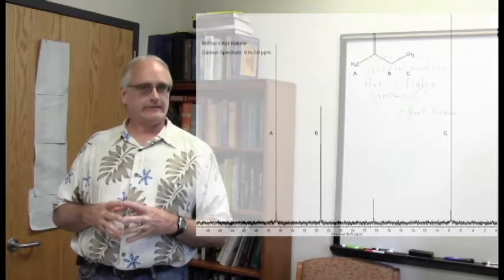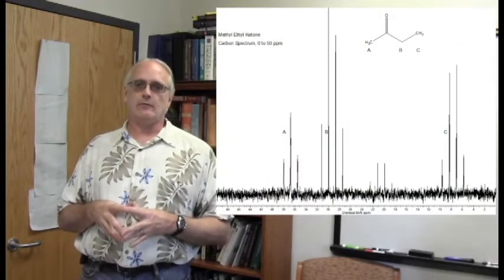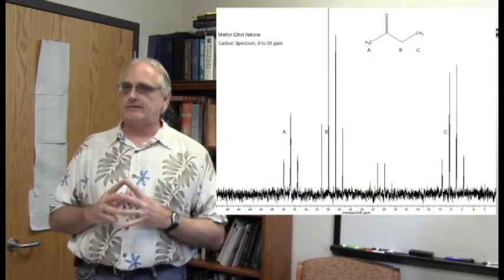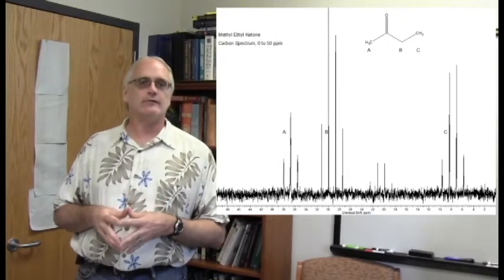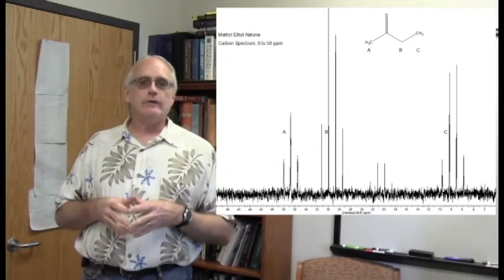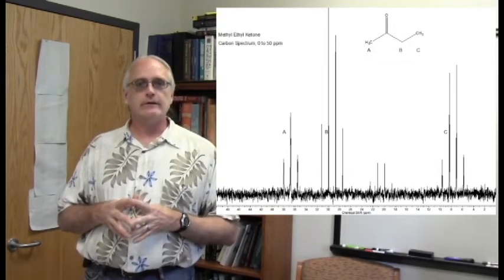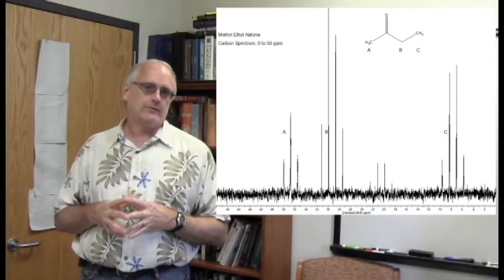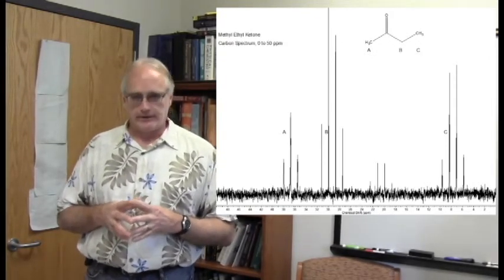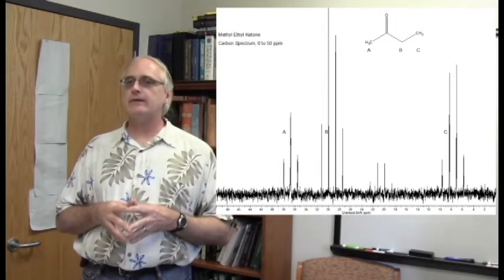Now take a look at this spectrum. I assure you, this is exactly the same tube, run at exactly the same time. It's the exact same sample. But my, what a different looking spectrum it is. I want you to notice in this thing, there are quartets. There is a triplet. Even it looks to me like the acetone contaminant down there has been split up into something. The student is exactly right.